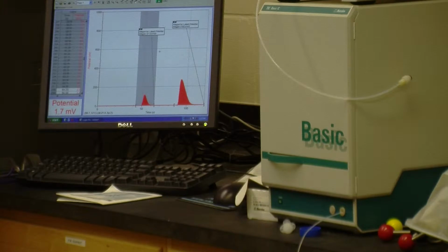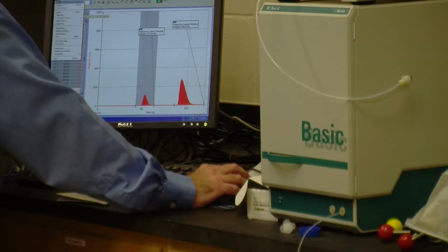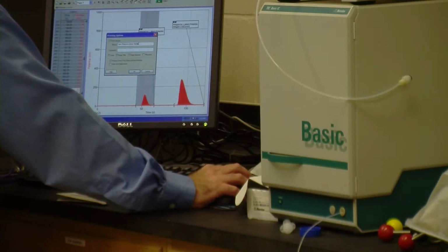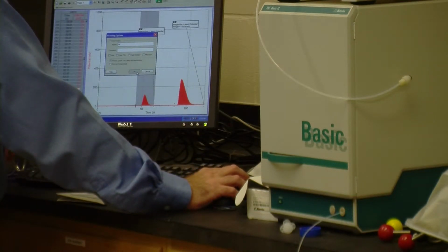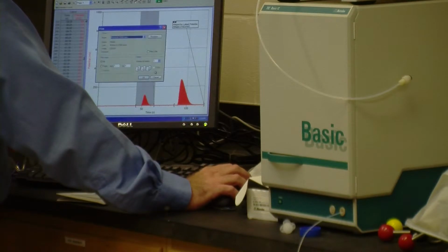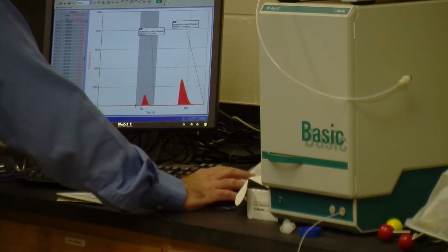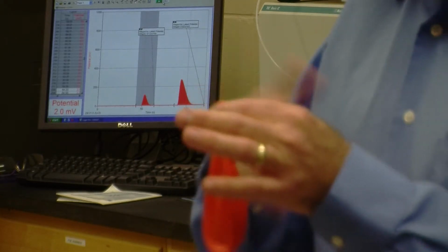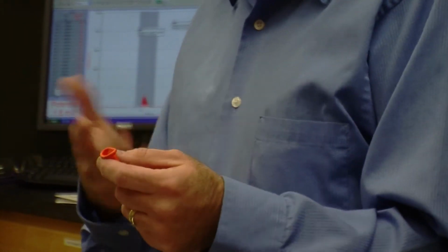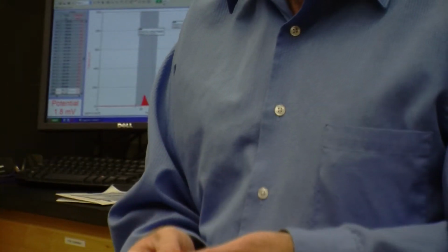Now what we're going to do is try an experiment where we see if we can alter that. And so let me print this out for you. So what I'm going to do, and normally I'd have you guys do it, but we're videotaping here. I don't want to put you in a bind. What I'm going to do is I'm actually going to breathe my own air for about 10 respirations and see if that affects the relative proportions of nitrogen and oxygen.